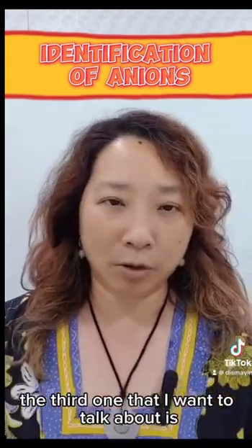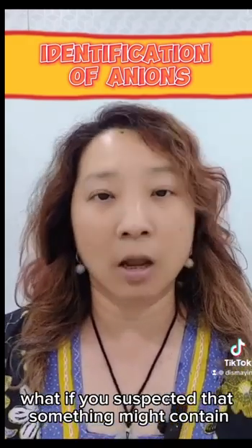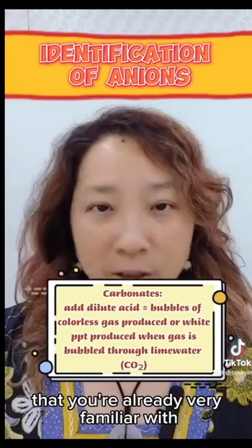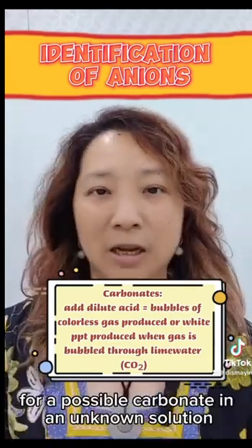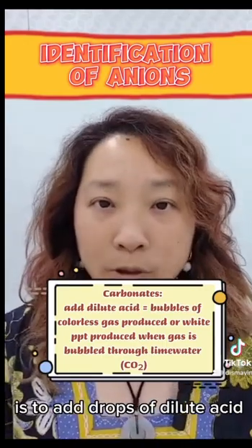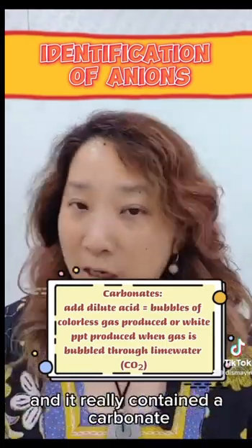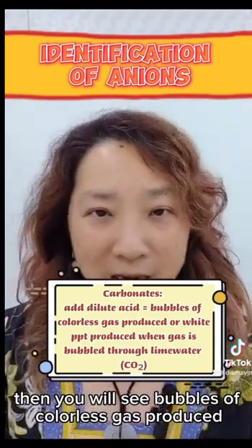The third one that I want to talk about is, what if you suspected that something might contain carbonate? It's actually a reaction that you're already very familiar with. The best way for you to test for a possible carbonate in an unknown solution is to add drops of dilute acid. Once you've added the drops of dilute acid and it really contains a carbonate, then you will see bubbles of colorless gas produced.